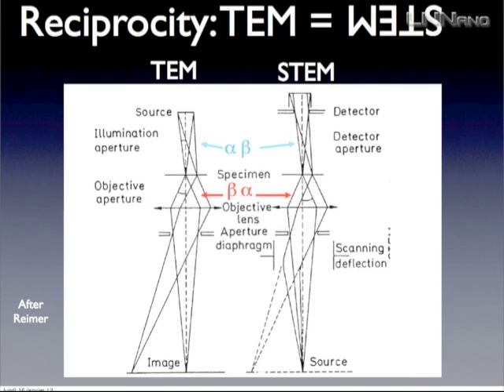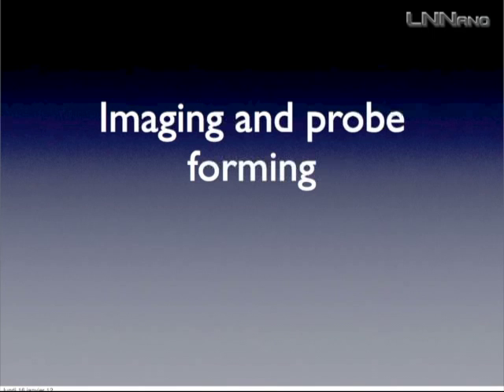It's not a true astigmatism. It's called, I think, tilt-induced astigmatism. But in any way, if you make a TEM and just try it once, and you put an angle in your incoming beam, you will see some astigmatism. And it's exactly what happened in STEM in the other part of the STEM. So it can be, in few cases, very interesting to make the comparison. But for that, you need to know TEM very well before. So sometimes it's a little bit not useful.